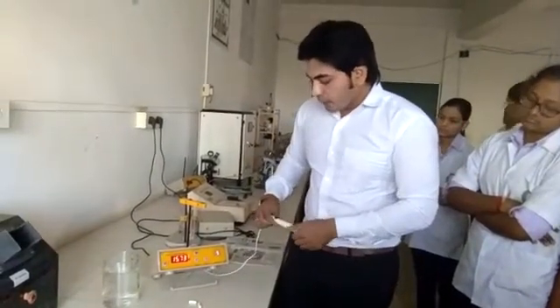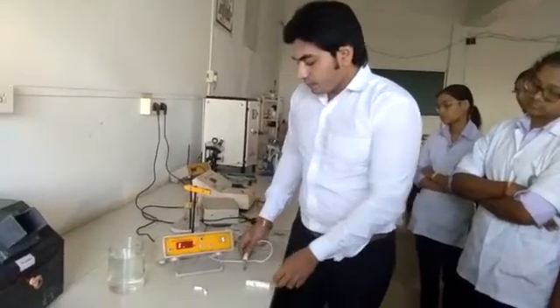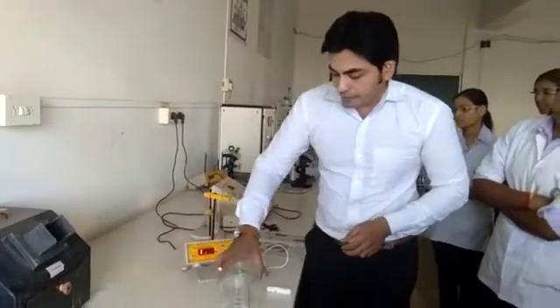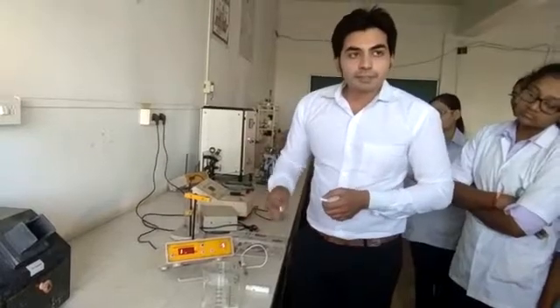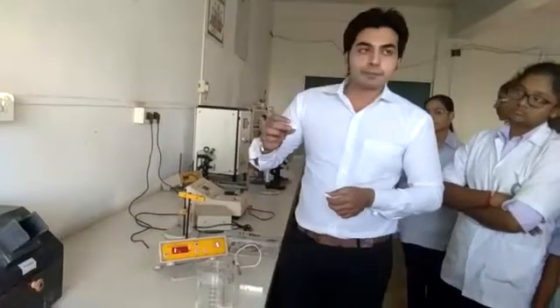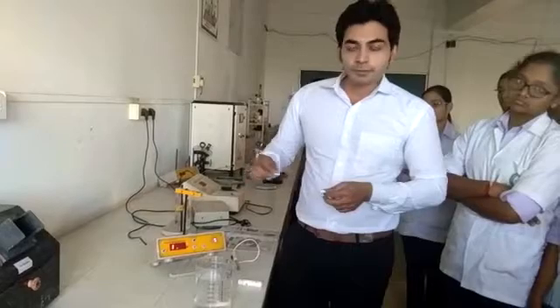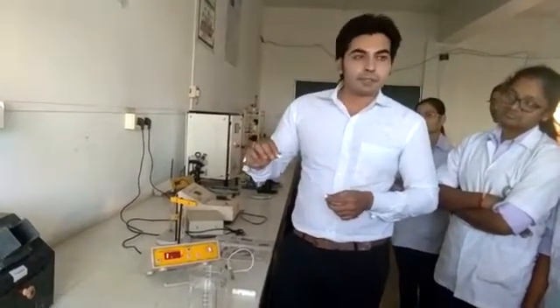Now let's see how to calibrate this particular instrument. You have to prepare a standard buffer solution by dissolving different buffer capsules in 1000 ml of distilled water. There are different buffer capsules of pH 4 and pH 7. You can select one of the pH capsules for calibration of this instrument, and dissolve the buffer capsule in 1000 ml of distilled water.